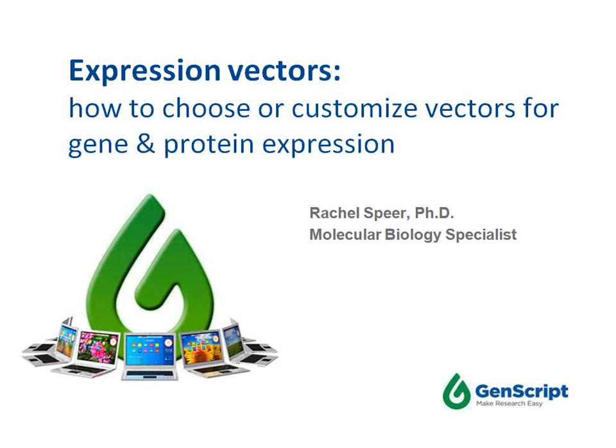I see that most of our attendees today are using E. coli or mammalian host cells, so I'll focus case studies on those areas, but we will touch briefly on other expression hosts, as well as on delivering expression constructs in vivo.